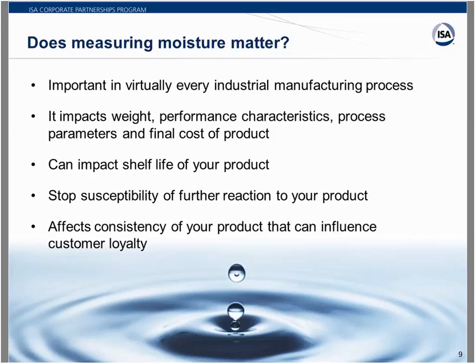And anyone out there that has tried to do parts per million or parts per billion moisture measurement understands moisture's extreme attraction for surfaces, metal surfaces, glass surfaces. It's extremely difficult to break the bond of the last molecules of water adhering to surfaces, and that will affect some of the measurements that we're going to talk about today.